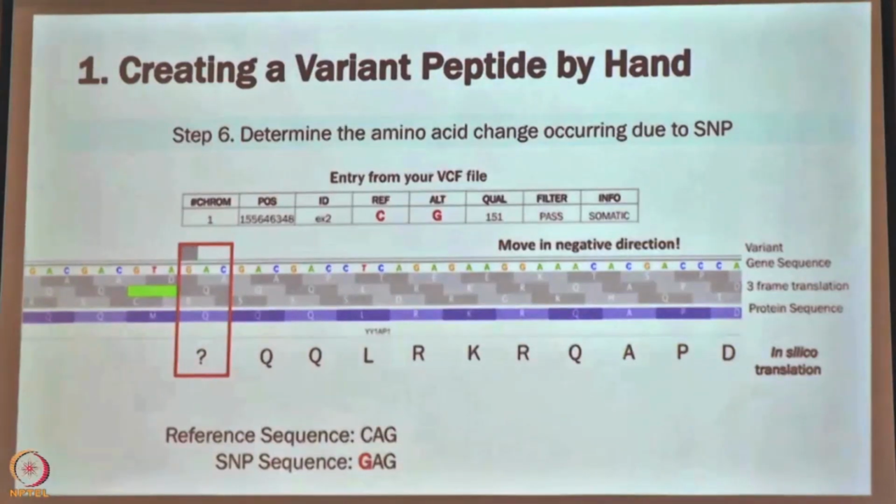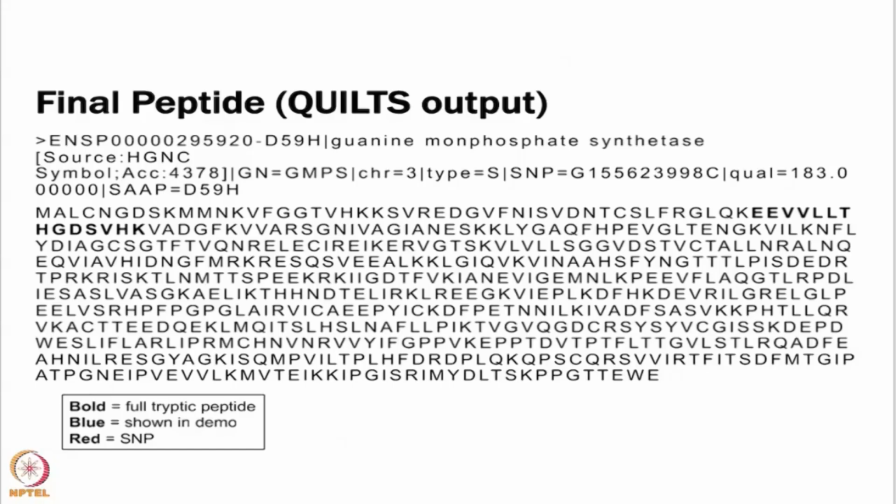So figuring out what that looks like. This is the right example, right? Yes. So all I wanted you to think about was how replacing this nucleotide would end up with a new amino acid that we would then change in the FASTA file that we would use in our database.